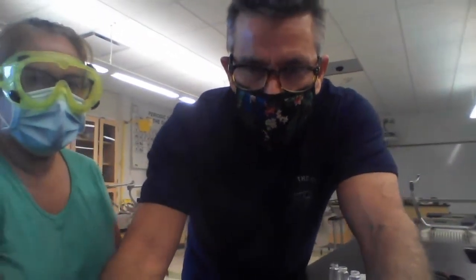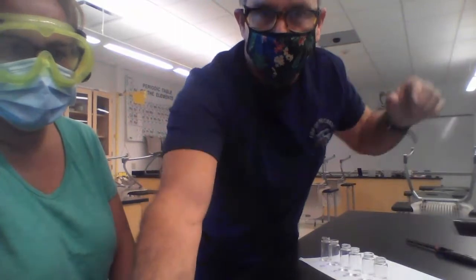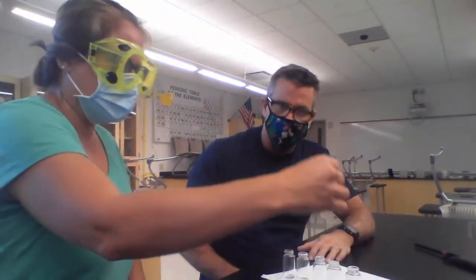Okay, hi everybody. I've got Mrs. Wagner here. Say hi, Mrs. Wagner. Hi, friends. And she is going to tell us what she thinks of each of these samples. So let me make sure I can get both you and the liquids here. Can you see them? All right, good. Okay, Mrs. Wagner, take a look at each one of these and tell us if any of them seem different than the others. All right.